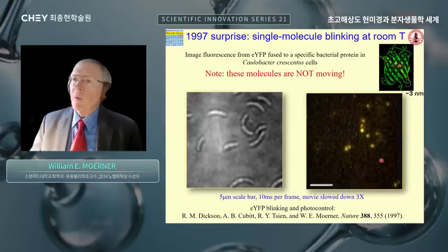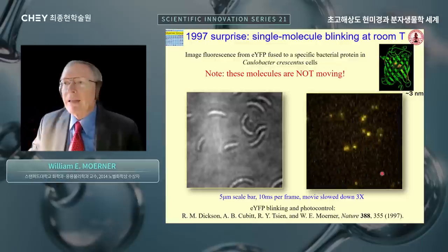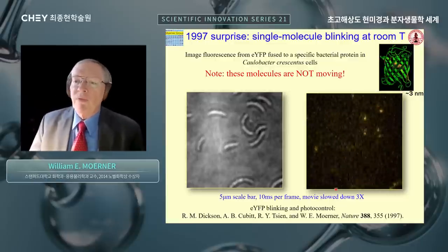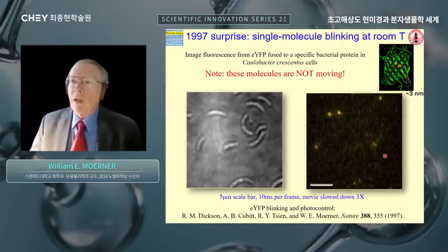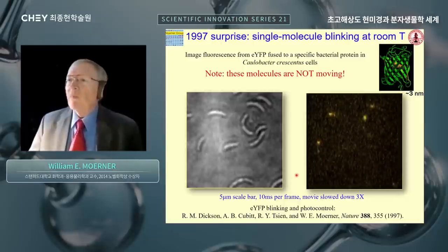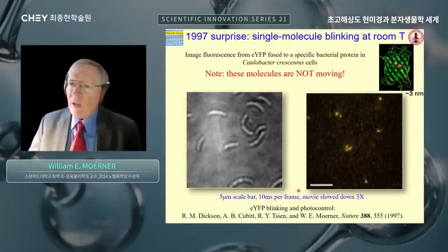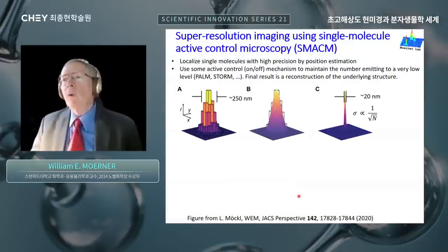And when we saw this, we were excited because it was a new scientific discovery, and the exact mechanism was not known right at the beginning. Various people made fun of us and said, oh, well, this is not going to be very useful because the molecules are too unstable. But of course, when you discover something like this, it's really wonderful in science that you can later perhaps think of something useful to do with it. So that's what I need to explain the super resolution microscopy that I mentioned.